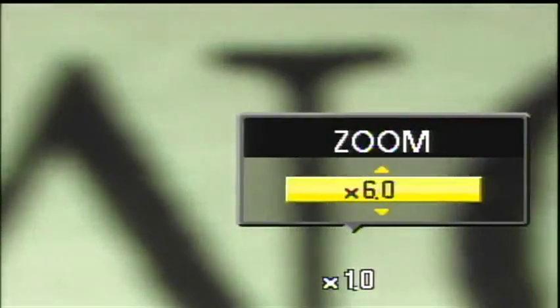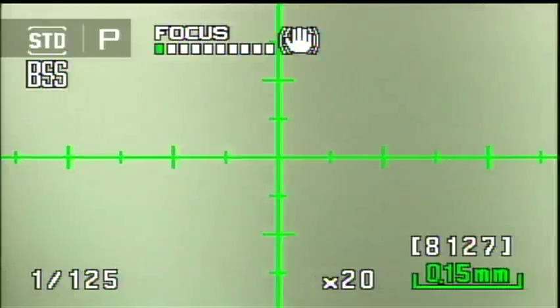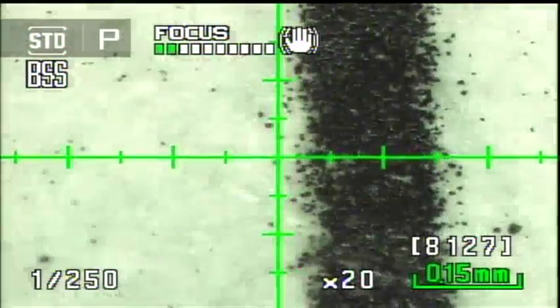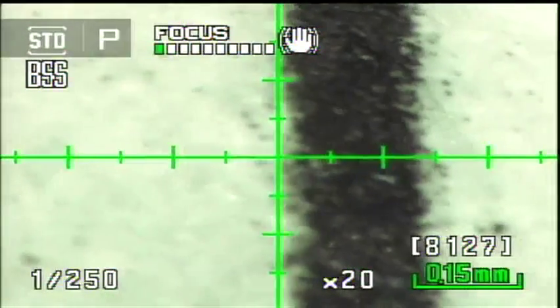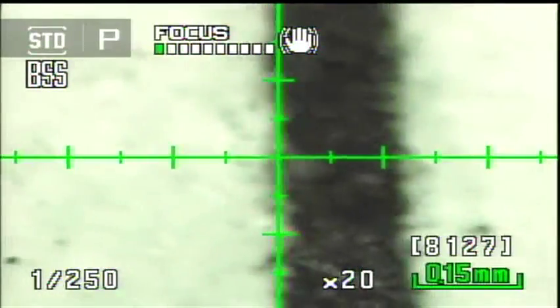Now I'm going to zoom in to 20x — I'll also turn the light intensity up a bit. Normally you'd be absolutely nuts to try a handheld 20x zoom with a microscope, because of the shallow depth of field and focus problems. As you can see, I'm trying my best to keep this in focus, but at 20x the depth of field is so shallow and there's so much vibration that it's almost impossible.